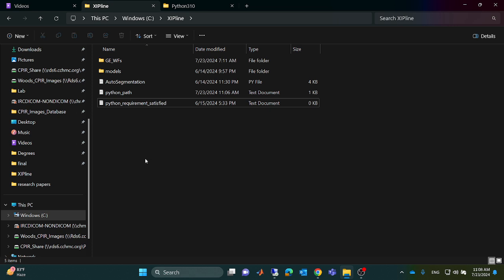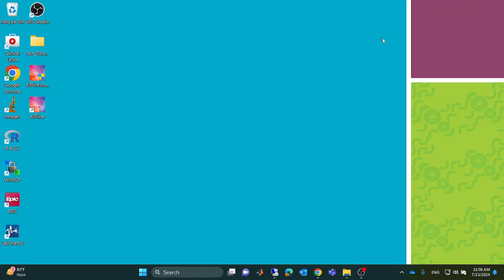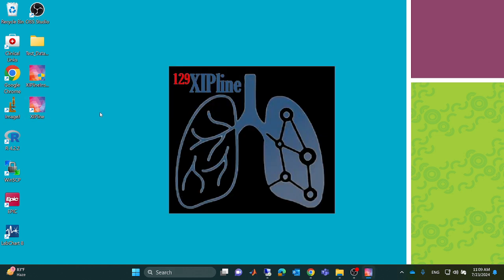Please also refer to the user manual document. We will explain this again to you. All right, so we have all the setup here. We have our Python installed already, and now we're ready to launch the application. All you have to do is just double click as with a normal application. This will take a few seconds to launch, as shown here.